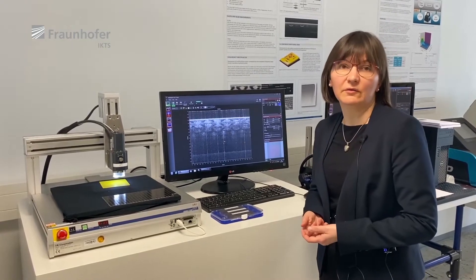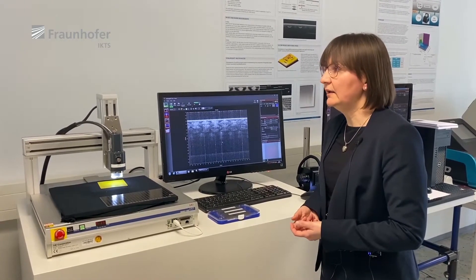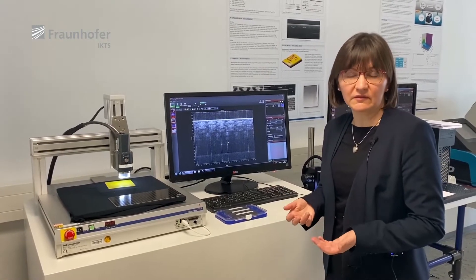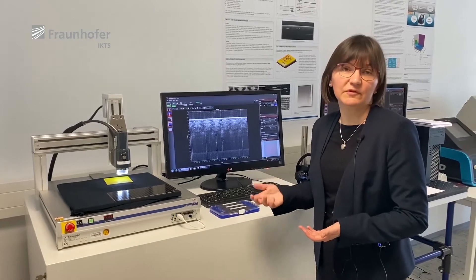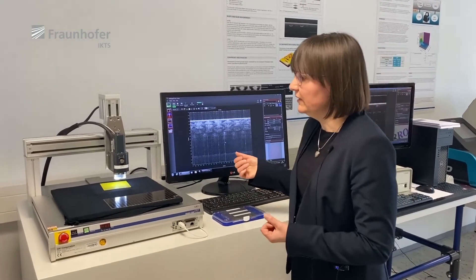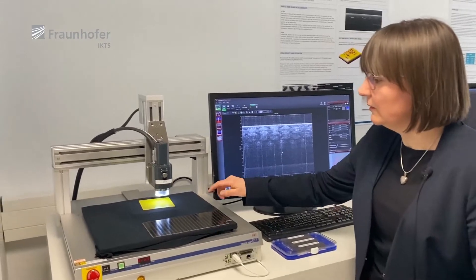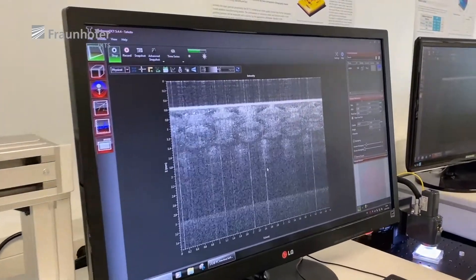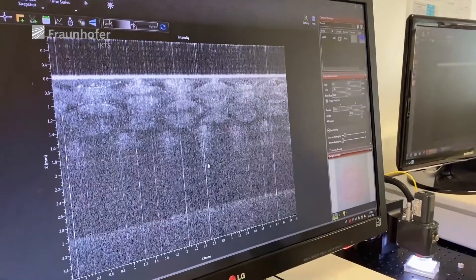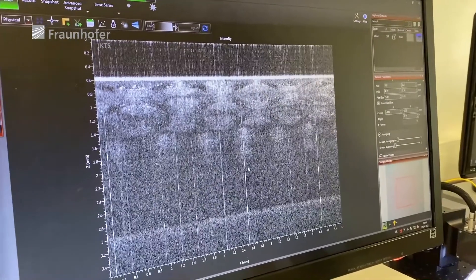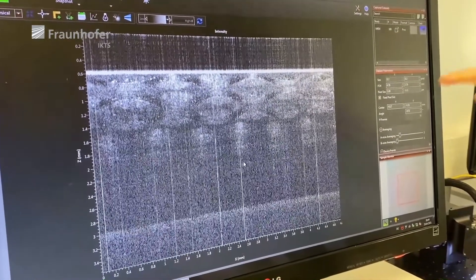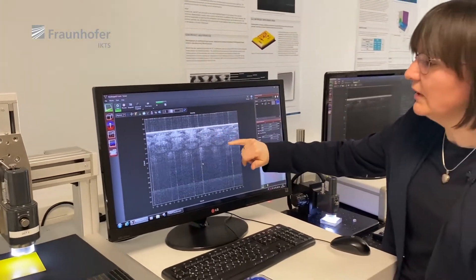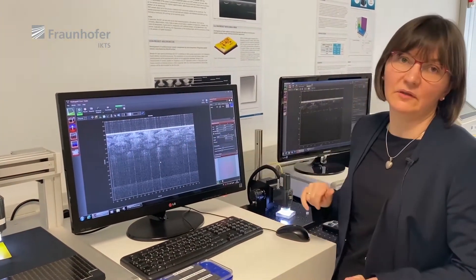The OCT system is based on the interferometry principle, which means we split our light into two parts. The first part illuminates the sample while the other part is preserved as a reference. When the light illuminates the sample, it partially reflects from the surface — visible here as a very bright reflection — but part of the light, if our sample has suitable optical properties, will penetrate into the depth. In this case, what we see here is a virtual cross-section of our sample showing differently arranged glass fibers embedded in a polymer matrix.